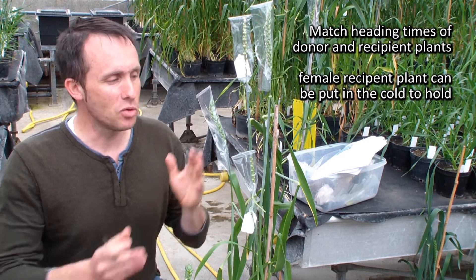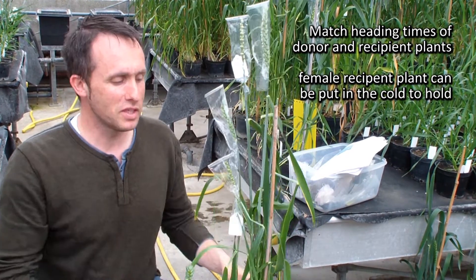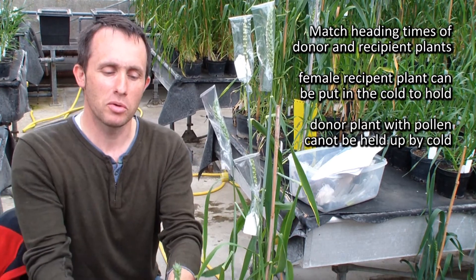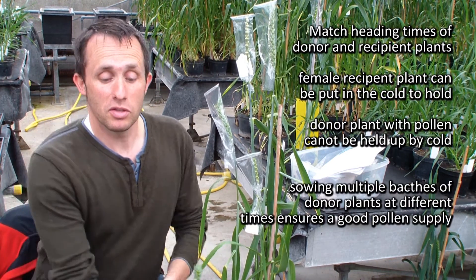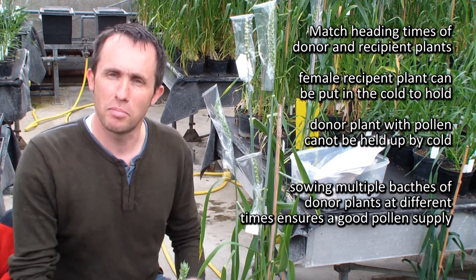Secondly, if you have your female part where your stigma is, this can be put into the cold for a while to hold it up. You can't really hold up the male because that will mess up the pollen. And finally, the other approach would be to sow multiple batches of your pollen donor so that you have a good supply of pollen.